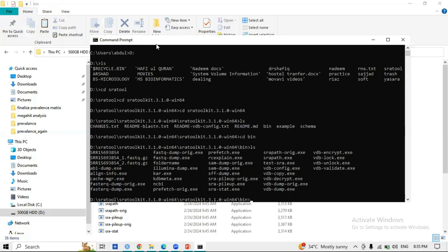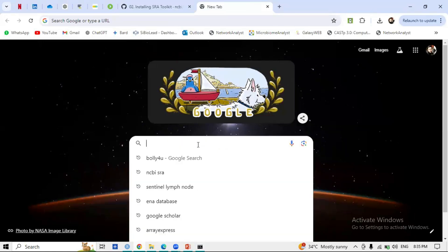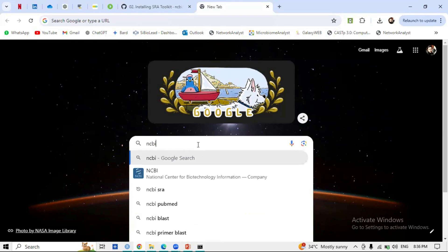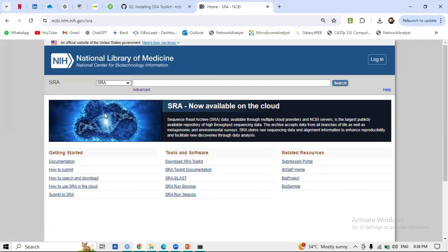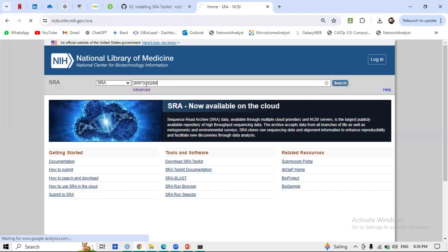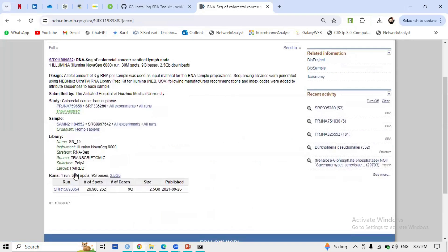Now, to find your data of interest, go to Google and open NCBI. As explained in the previous video, navigate inside the biological databases to find your accession number. For example, we have a project accession SRP333528. There is a study for RNA of colorectal cancer; I have discussed how to check what data is inside this study. I am interested in downloading a specific sample — this sample is related to RNA-seq, paired-end, and I want to download it.